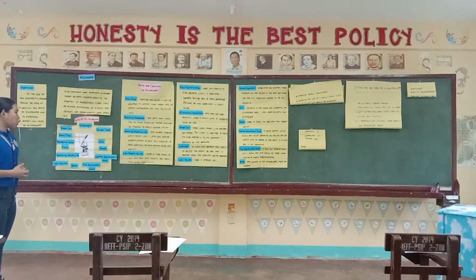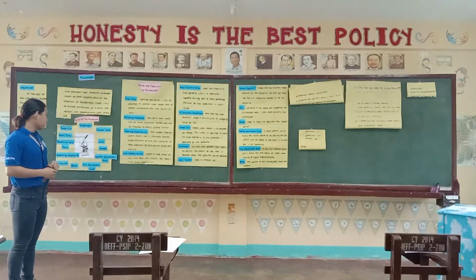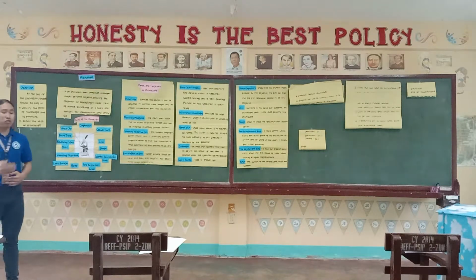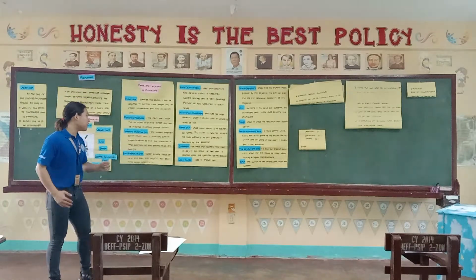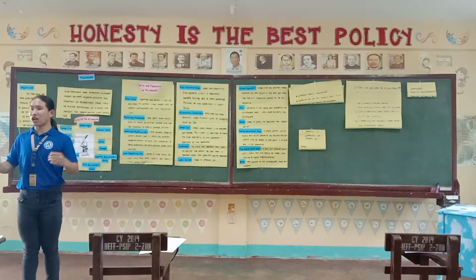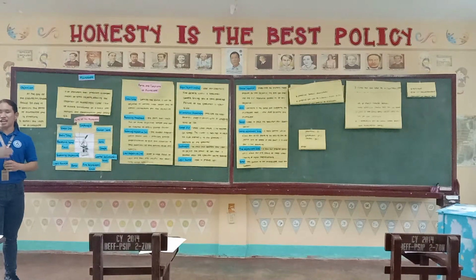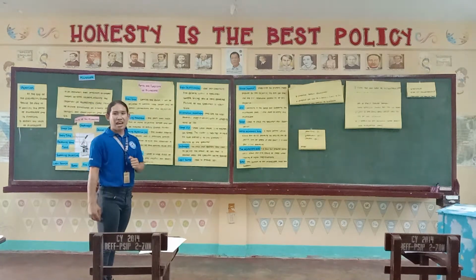Now let's move on to the light source. So, Mr. Domingo, please read. What is a light source? Okay. The light source is used to produce light. Meaning, for you to clearly magnify and see the entire structure of a cell or a specimen, you have to use that light. So, ang light na ito mag-produce siya og light para makita ang entire structure. Is it clear? Alright. Now let's move on to the ocular eyepiece.